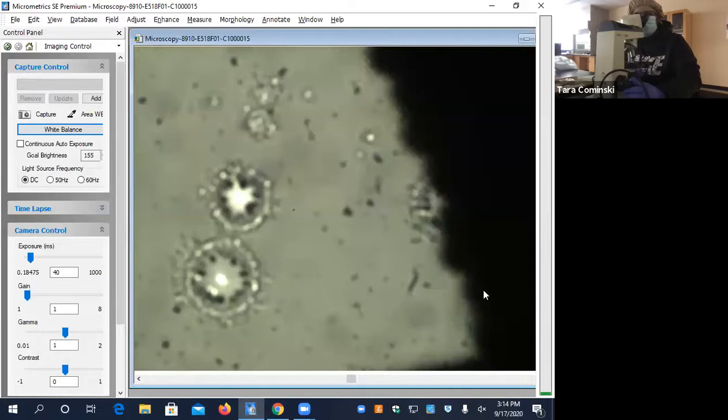Okay, part D, answer that one. What's the total magnification when you're using your microscope under high power? What do we mean by total magnification? I went through this in the lab demo. Wait, say that again? Sorry. Total magnification. Like the highest one?